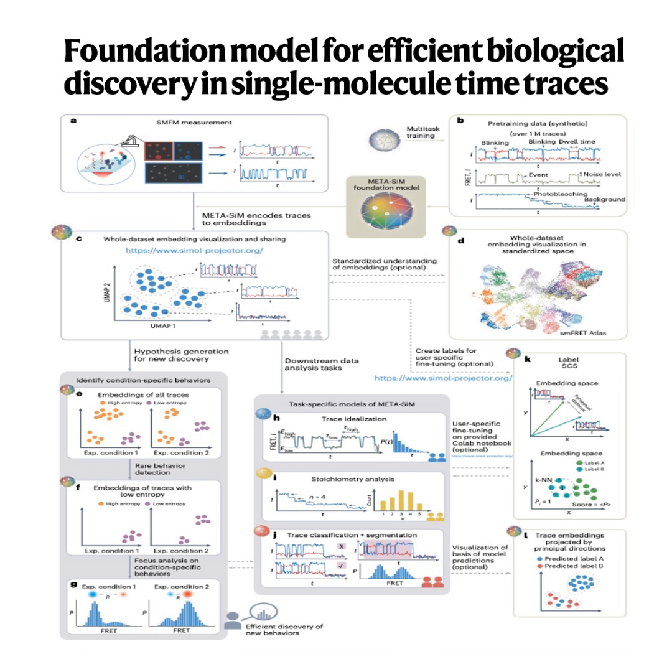Right, HMMs. Those are statistical models that assume the molecule hops between hidden states, and the model tries to figure out what those states are. But they can be tricky to use, and need expertise. They really do. And they often struggle with very complex dynamics or subtle changes. META-SiM learns to do this idealization task, but within this broader multitask framework.